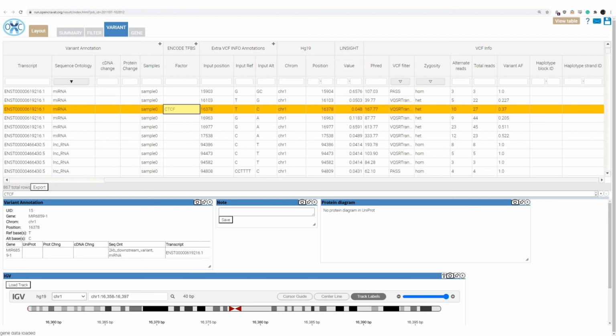Variants that impact functional regions of the non-coding genome may be more likely to be disease relevant. Supporting information such as evolutionary conservation, allele frequency, or sequence features can inform on the likelihood of that variant to directly or indirectly influence disease.